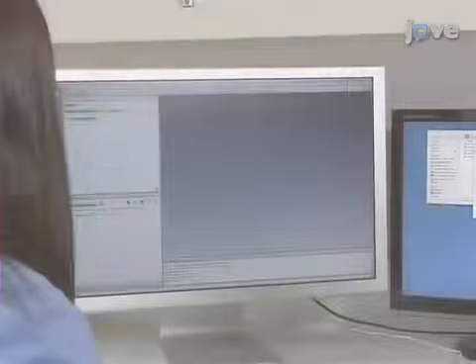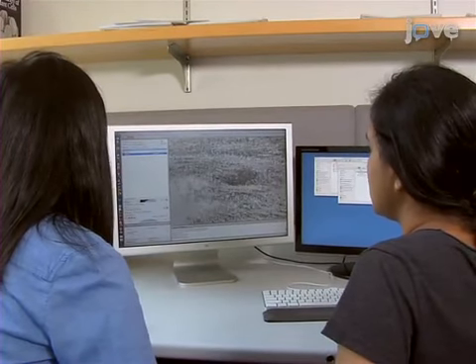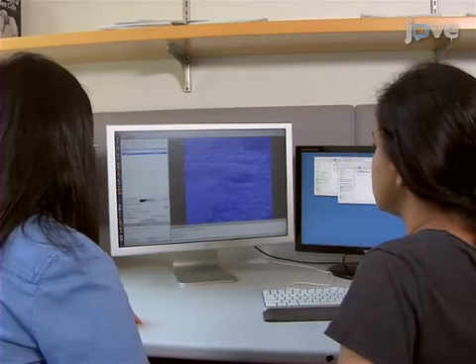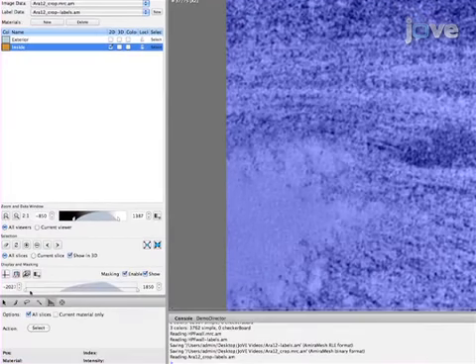Automated density-based segmentation is used on datasets with any variety of contrast, crispness, or crowdedness to withdraw the densities of interest. To begin, import volume data into a program equipped with thresholding, magic wand, or other density-based tools for automatic segmentation, as done in the manual tracing of features of interest technique. Amira software is used in this demonstration.